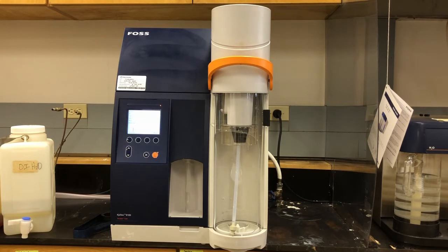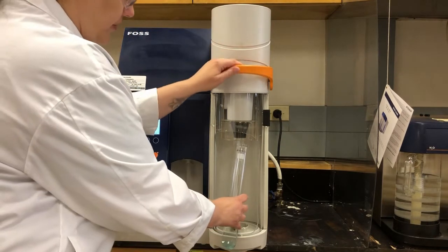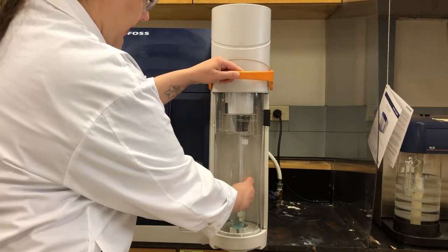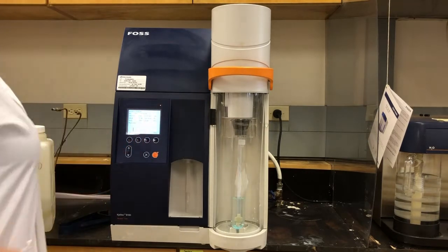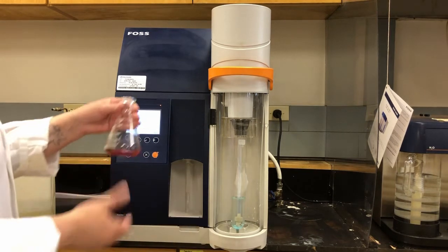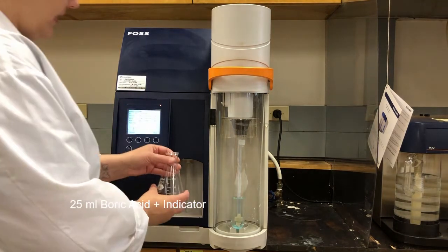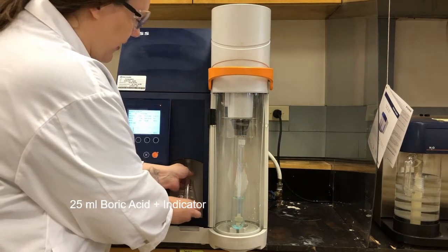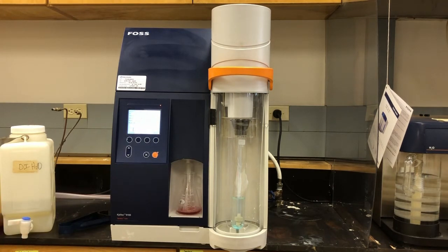So when we put our sample on, our sample tube fits in here. And this tube that you see in the middle is the tube that supplies the steam. So make sure that's in there nice and secure. It has a safety door so that if there's any splashing of alkali or anything, it stays contained within the apparatus. This is our receiving flask, and in this flask is 25 milliliters of boric acid, and it also contains an indicator. So there's an indicator in there that will change color when the end point of our reaction is reached. So this is an automatic titrator.